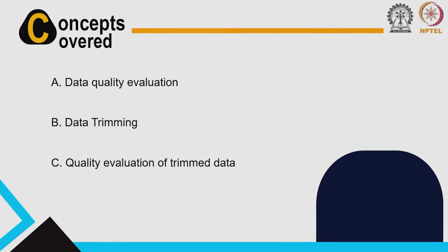So, what we are going to do today is look at the results of that FastQC run. We will evaluate if there is any issue or any problem with the data. Once we do that, we will do some pre-processing if required. For example, if we require trimming, we will do that. These are the topics that we will see today.